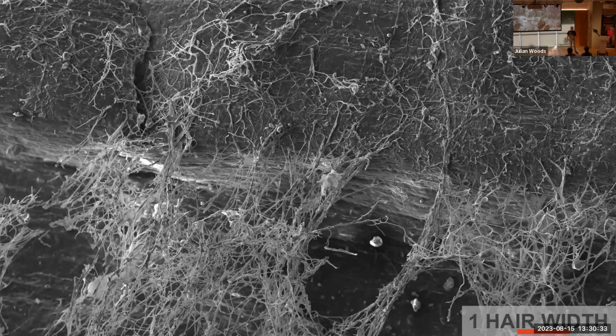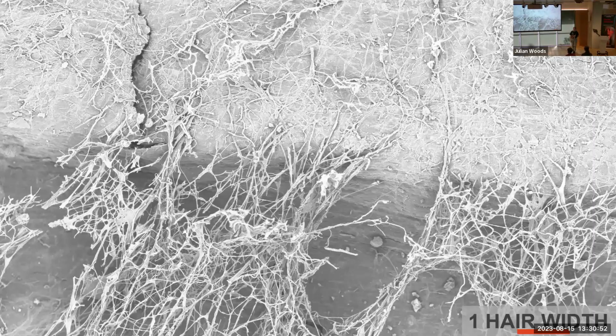Using that, because that interaction with the atom will be different every time for different elements, we can map the composition of a sample. So this is our mold in our secondary electron image. Like before, we discussed, it looks at the surface structure. And if we go into backscattered electron imaging, you can see that it all shows up as the same color. That's expected. Hopefully mold is growing and made out of the same thing. It's all carbon-based, it's all organic.